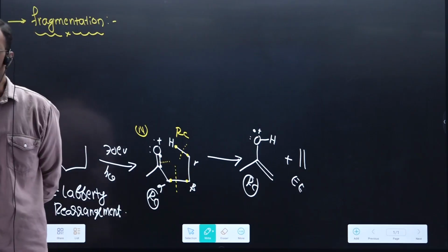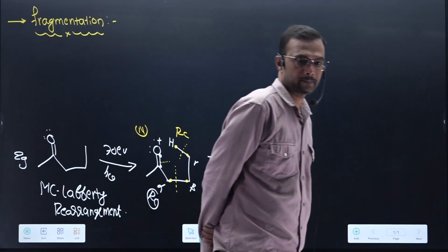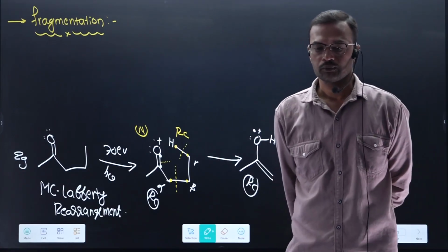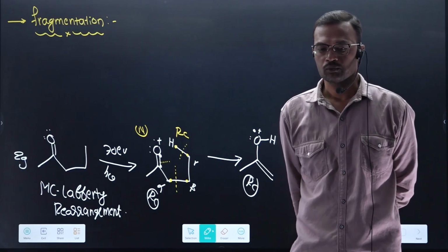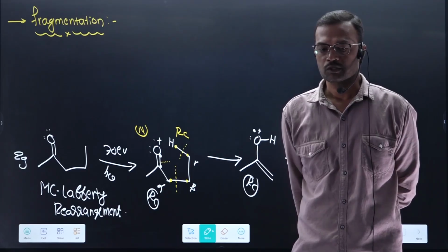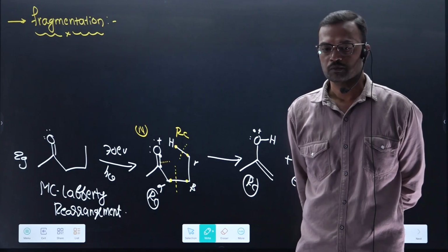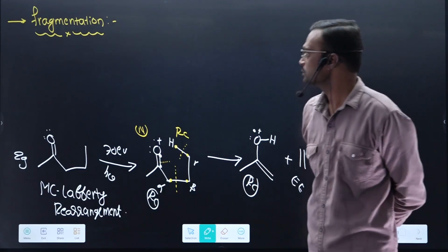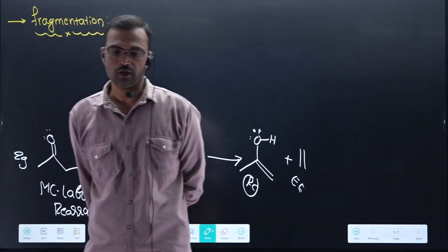The process of cleaving molecular ion into small species is known as fragmentation.